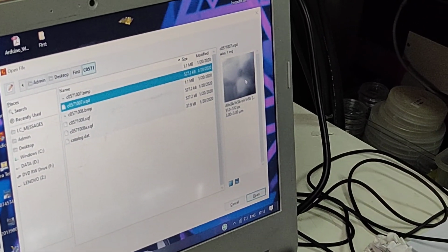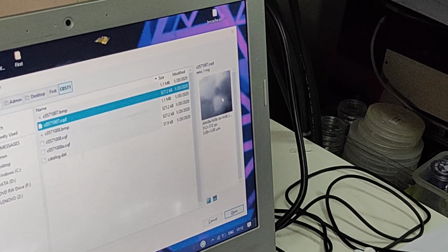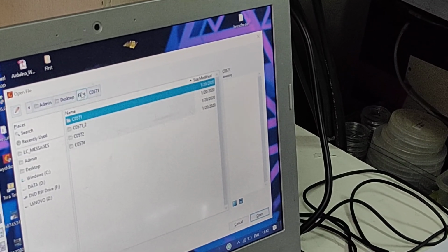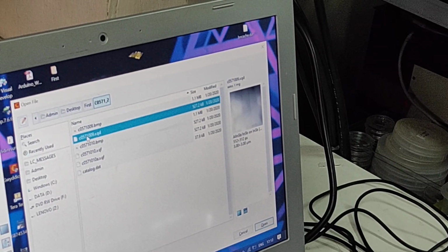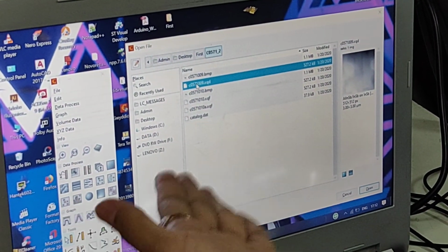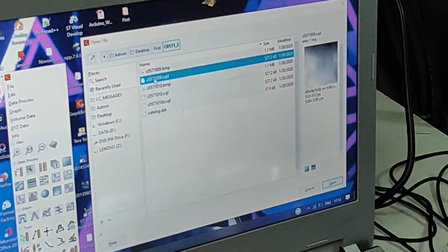I think this is the match sample, right? Not good. This is the first sample. You don't have quantum dot. What can I do? I want to see the sample with quantum dots.